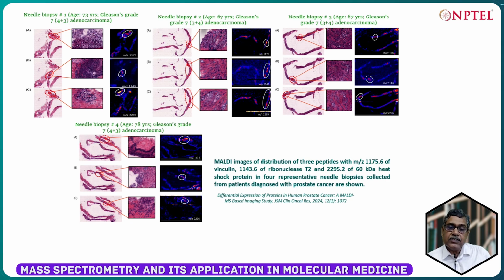If a molecule is there, then it will be there forever, irrespective of the patient. So, once we got to see these 3 molecules that are very much related to prostate cancer, that's what we have discussed in today's class, that is seen in the needle biopsies also.